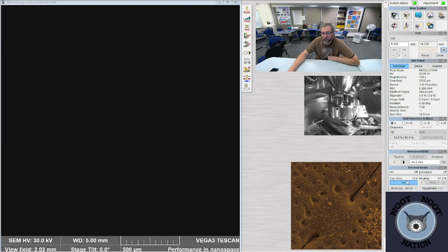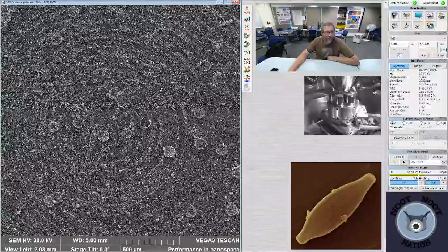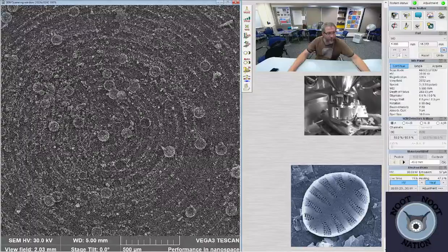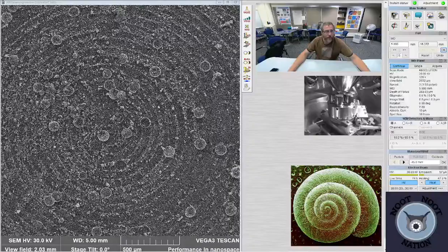I haven't been in my lab for a week now, so hopefully everything still works. Looks like it does. I got some of these samples from Pacific Plankton and some of them from one of my colleagues' graduate PhD students. I'm on their committee, and they just wanted me to check out some of their Stephanodiscus in here and see what I thought they were.